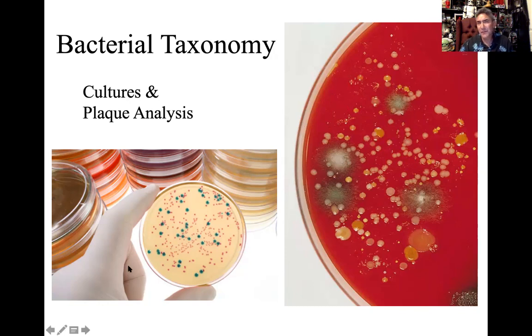I think you were doing some lab assignments with the gram stain technique. Well, before we can get to gram staining, we first have to culture bacteria. The way that would be done, we would get a clean agar plate, and depending on what type of bacteria we're trying to grow, there are different types of growth media. Growth media is basically a mixture of nutrients, amino acids, and minerals that these bacteria would need to grow. So here's just the regular agar.